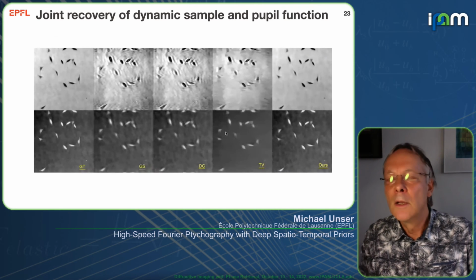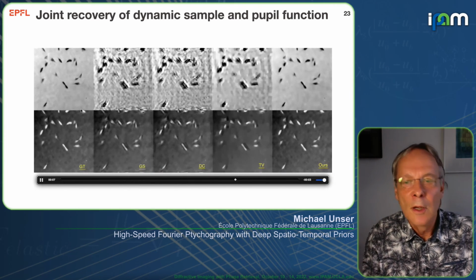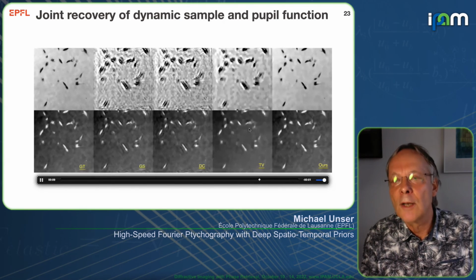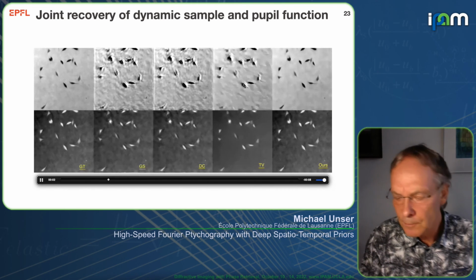And now if I show you the video, I think you will appreciate the quality of those images compared to the others. So now, I would say that total variation does relatively well with the phase, but not so well with the amplitude.